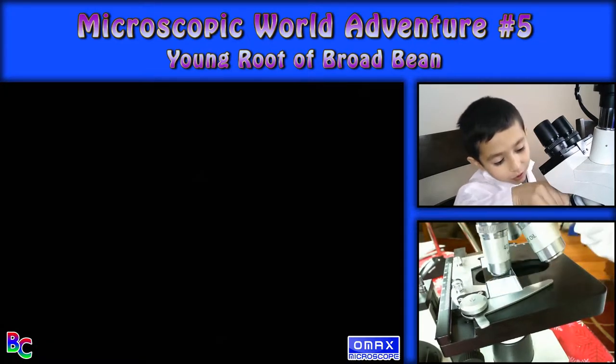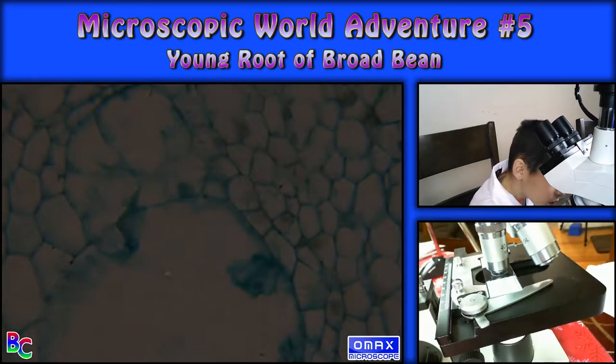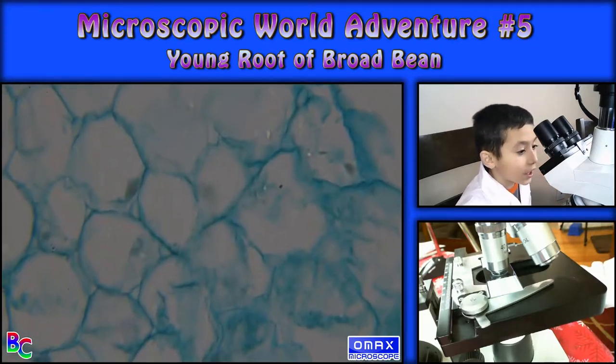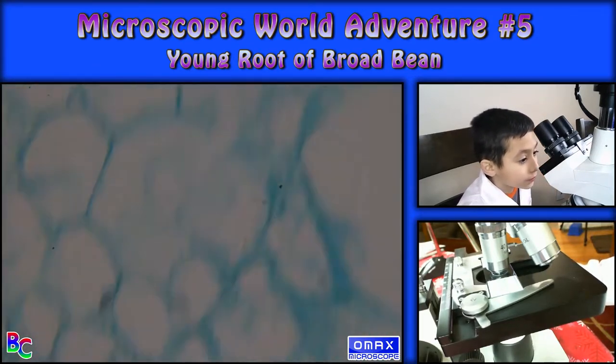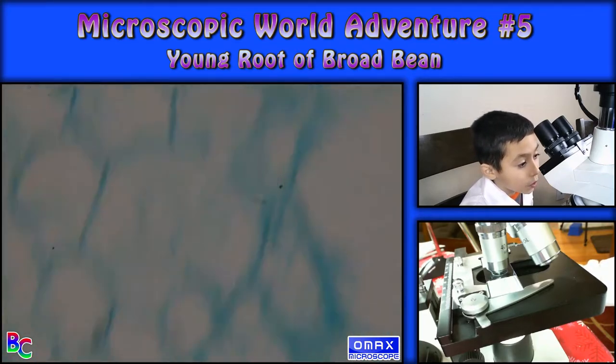But anyways, let's move on to another higher zoom. Oh yes, getting into the texture. So that's purple — I guess that's like ink.